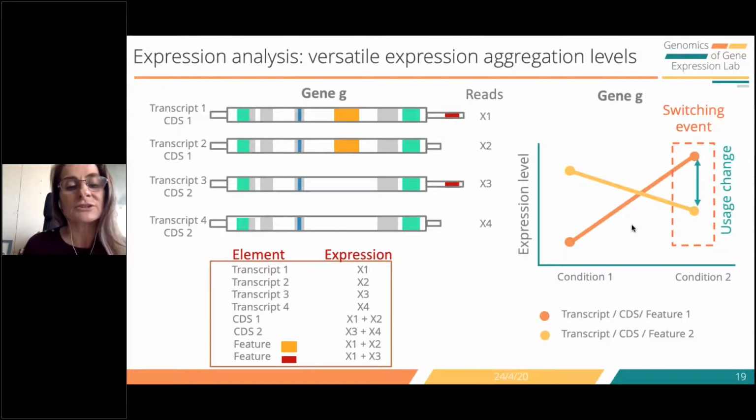For the part of expression analysis, we have envisioned a way in which we can quantify the expression of the different elements that we want to analyze. And this is actually very simple. And again, if we consider a gene with, imagine these 4 transcripts that are different, okay? So if you look carefully, so this again will be the coding region, and this will be the UTRs.